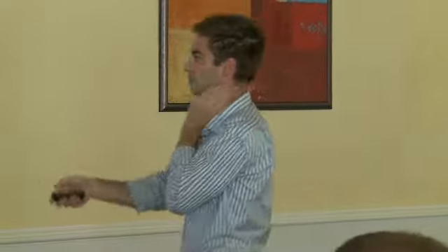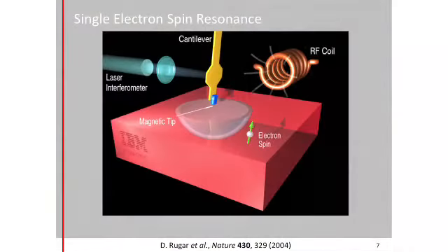And sort of recent progress in micromechanics, nanomechanics, atomic force microscopy has allowed us to make extremely tiny and extremely high quality factor mechanical cantilevers that make this kind of approach, where you have a cantilever with a magnet near a small magnetic moment, a much more sensitive way to measure the dynamics of this magnetic moment. So the basic idea is we just take a lever with a magnet and put it near our sample of interest to measure the spin dynamics. And this was first realized, let's say, with a modern AFM cantilever in the Rugar lab at IBM. And these are some view graphs from the first paper in Nature in 1992.